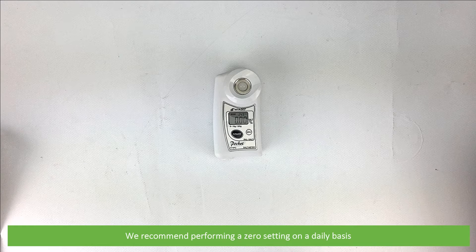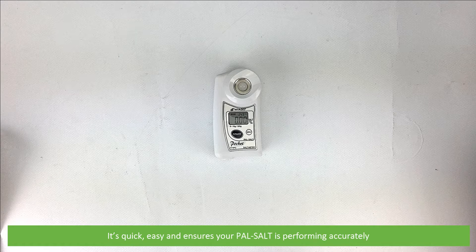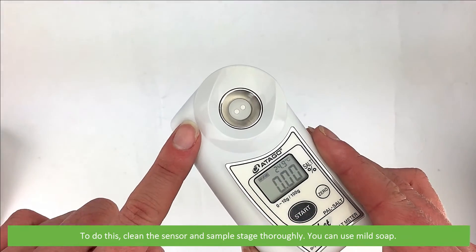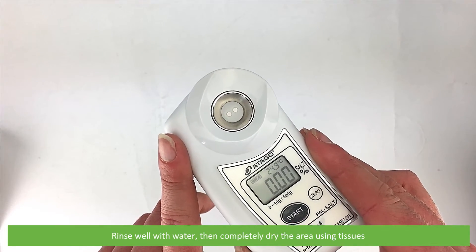We recommend performing a zero setting on a daily basis. It's quick, easy, and ensures your PALSALT is performing accurately. To do this, clean the sensor and sample stage thoroughly. You can use a mild soap, rinse well with water, then completely dry the area using tissues.